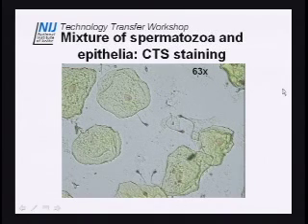Okay. And this is at 63x objective, and now it's actually nicer. You can see the red a little better on the slide, and 63x objective is much better to see. And what's nice about the laser microscopes, I'm not sure about all the other systems, I'm assuming they're probably the same, you have a screen where you can see a nice big image, and that's one of the great advantages of this technology.